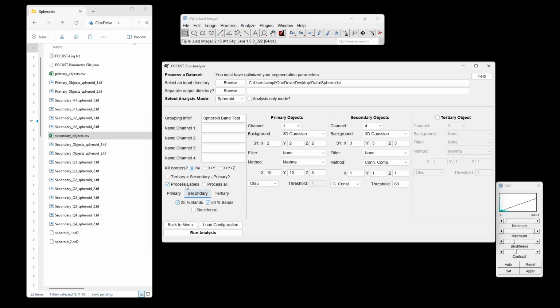But yeah, that's a tour of the additional processing options we have here. And again, that's all been saved into my parameter file. So now if I wanted to redo this entire experiment, even with my additional secondary processing and such, I can reload these exact parameters and replicate that. I think that's all I had to show you.